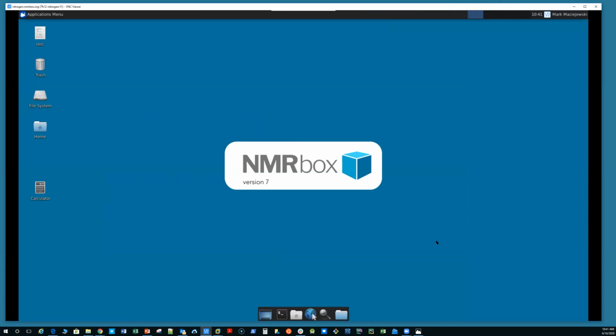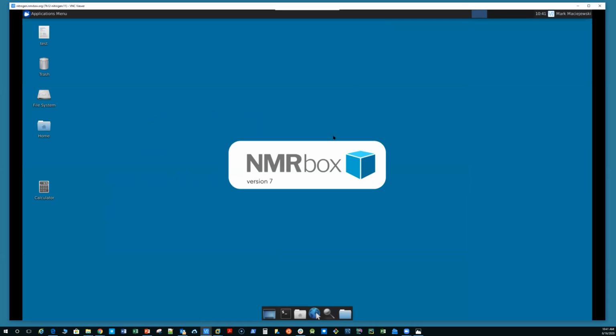So any jobs or anything that I had running would have automatically been closed. But this is a nice clean thing to do once in a while. Every once in a while you might find glitches where things aren't working properly. You want to go ahead and log out, and that's one way to log out. And I'm going to show you another way as well.